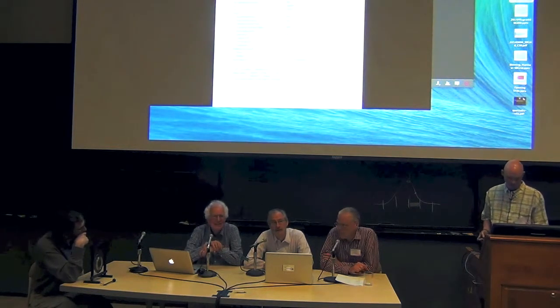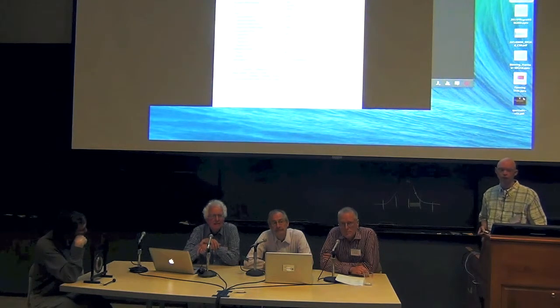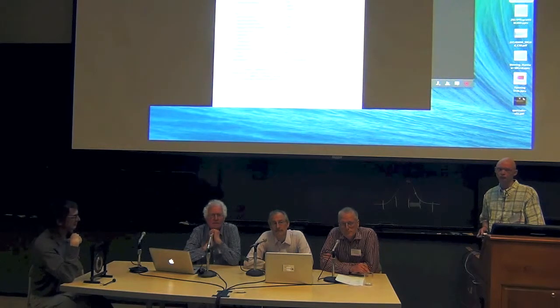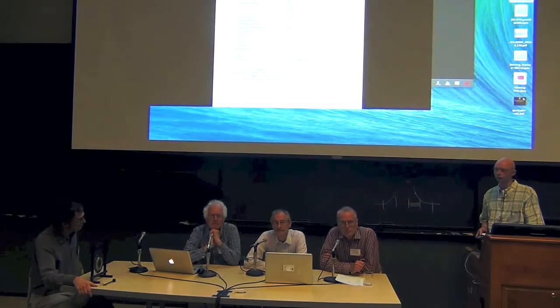Okay, what about number of parameters, number of observations? Let's say I have NCS factor 12, and then there is another structure which has NCS factor 1. Obviously, the information content, if I use NCS, will be different for those two structures. So how to put this in the table? I know that this is already beyond the data processing, but to some extent, this is never finishing in the table either. So I would like to have it too.